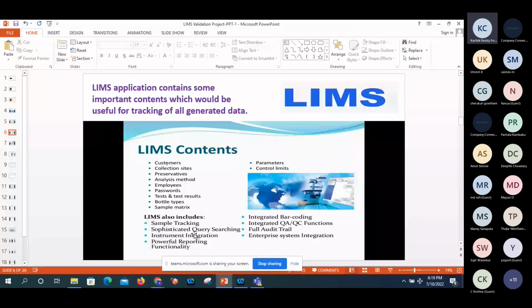Coming to powerful reporting, COA generation will happen once a lot is generated. There is environment monitoring, and an environment monitoring trend report will be generated. There are control limits also. In a quality control laboratory there are OOS, OOT, and out of calibration events.